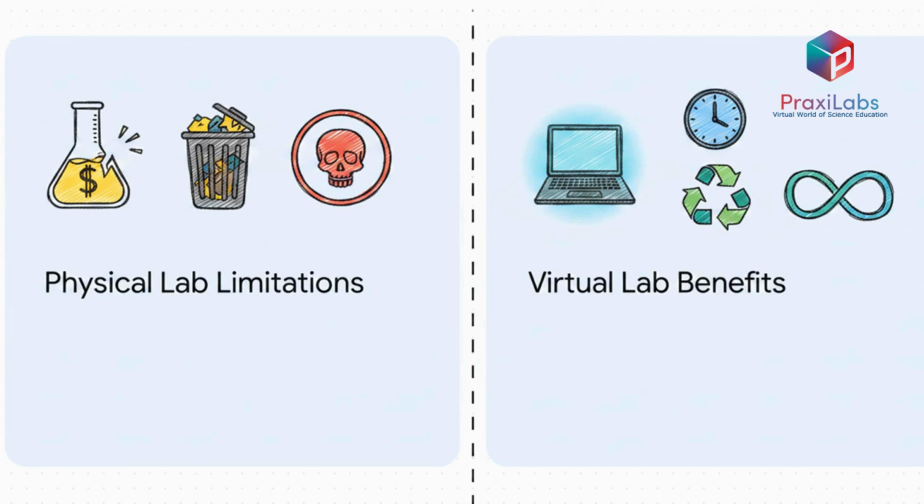Virtual labs powerfully flip that script. They offer zero material waste. They grant 24/7 remote access so students can learn from their couch at 2 in the morning if they want. It's a risk-free environment that allows for unlimited repetition, completely removing the financial and physical barriers to learning.